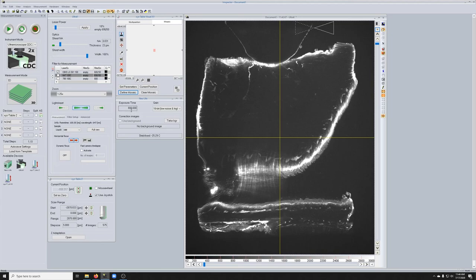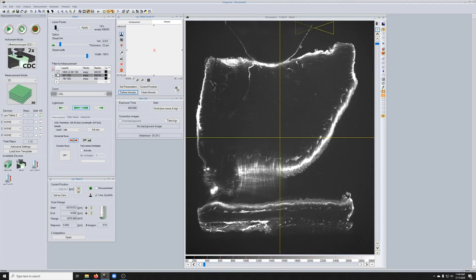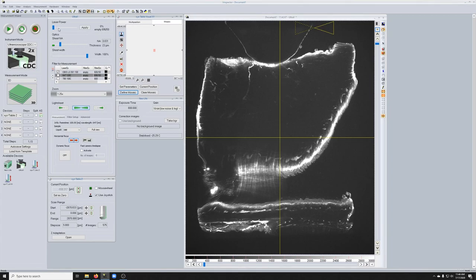Based on what I told you to get the same quality, but with a 10 millisecond exposure, we would need 80 times more laser power. How can we get 80 times more laser power? Is that even possible? This slider, you can see if I move it, it changes this percentage.